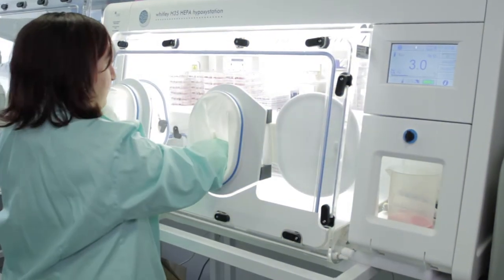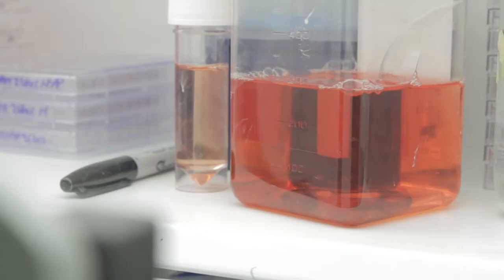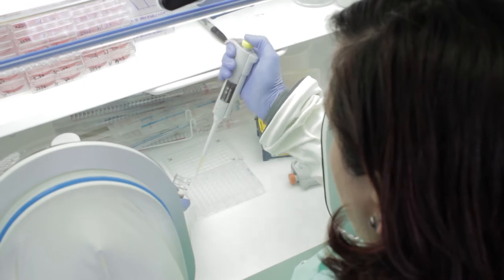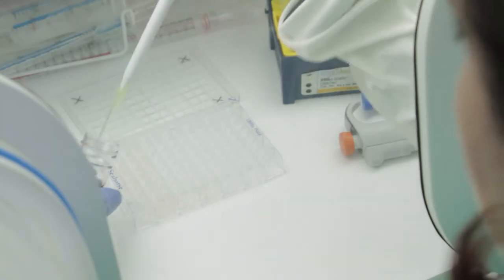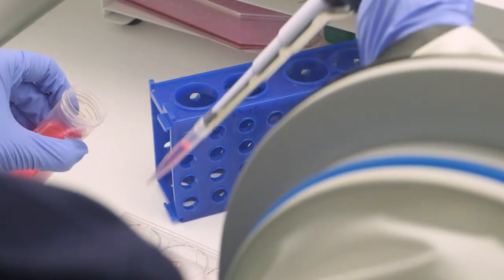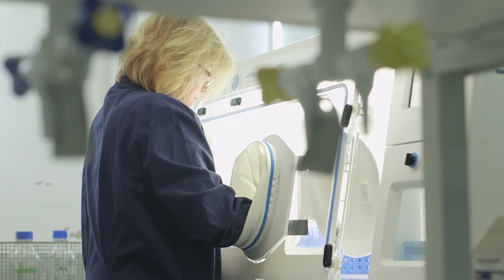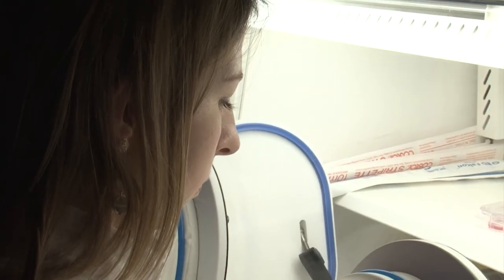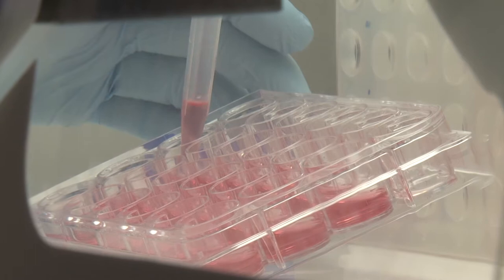Whitley hypoxic stations create physiologically relevant conditions within a controlled and sustained hypoxic environment. They are ideal for cell and tissue culture researchers wanting to accurately control oxygen, carbon dioxide, temperature and humidity. We are confident there is a hypoxic station within our range to suit your application.